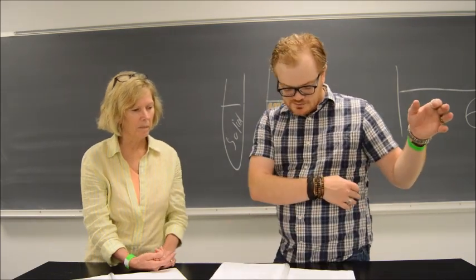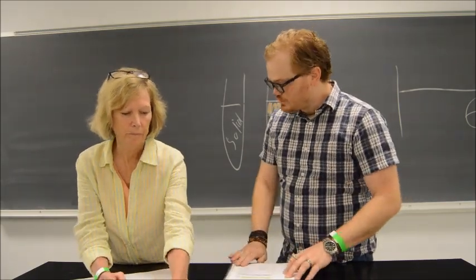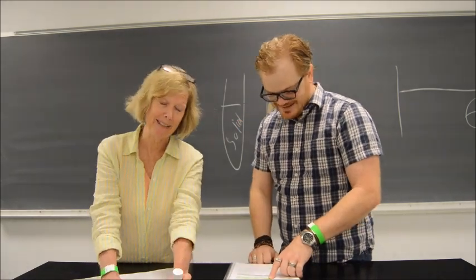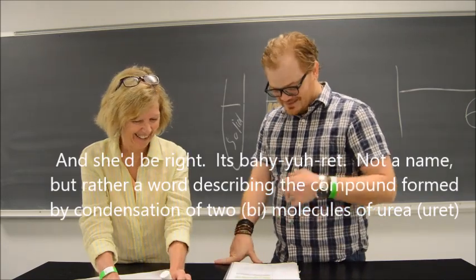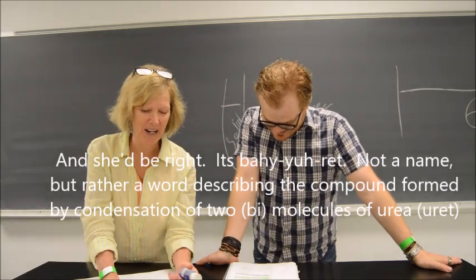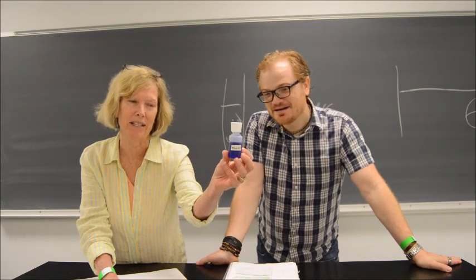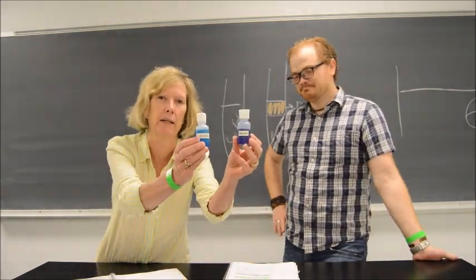Now, we can test for the presence of peptide bonds, if you will. We can test for the presence of proteins. We can do this by using, well, I say Biuret, or potentially Biuret. You can go and Google search and figure out your own ways. But regardless, mine is a Latin version, and Mr. Hopper told me his is a French version, so you'll have to see. But regardless, it's this midnight blue solution. And notice that it's a different color than your Benedict's reagent.